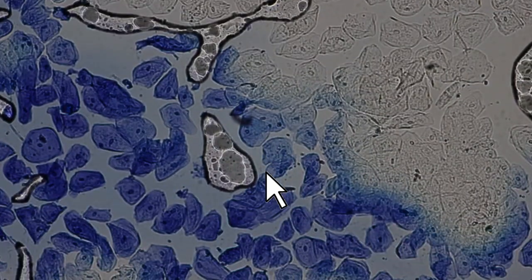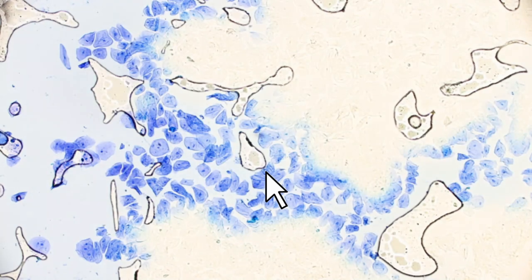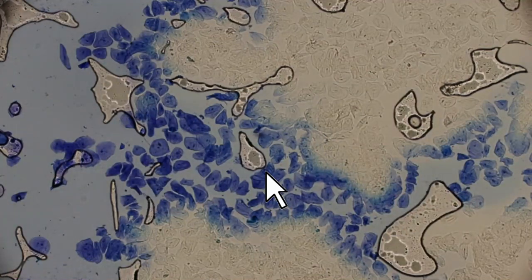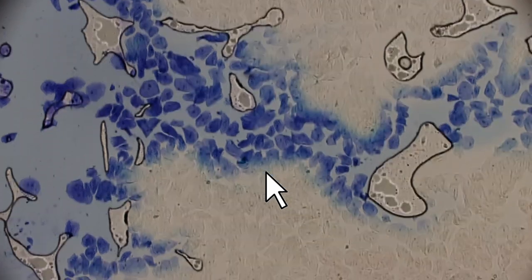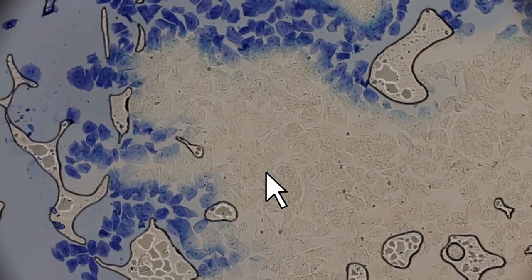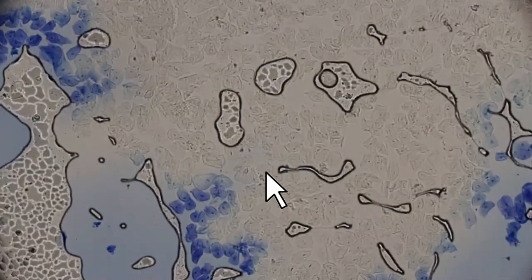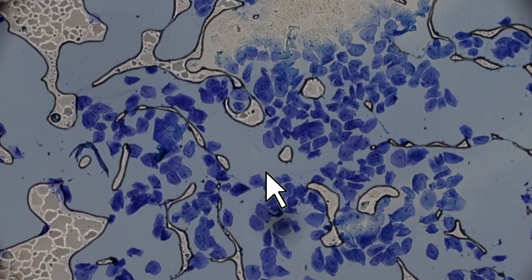Let's get a larger overview. So I'm going to go down from back to, oh, just a second, I forgot to flip up the condenser a little bit. So yeah, that's a better overview. Let's go down a little bit with the thing here. Yeah, very nicely. You can now see how the outer parts are stained first. And of course, because I used the toothpick, the density of cells here is much greater. Look at this. It actually looks quite nice.